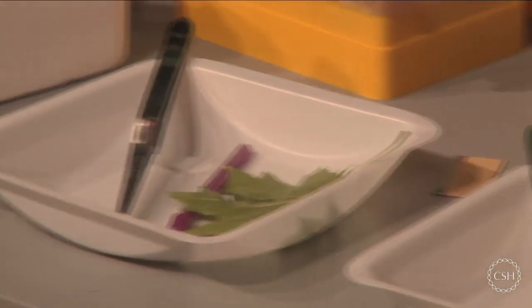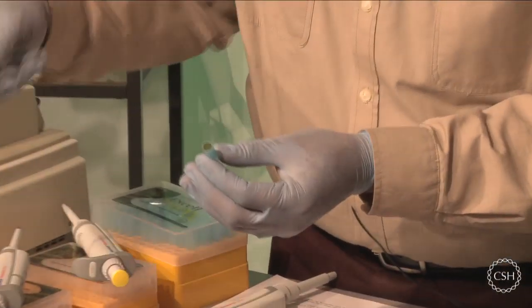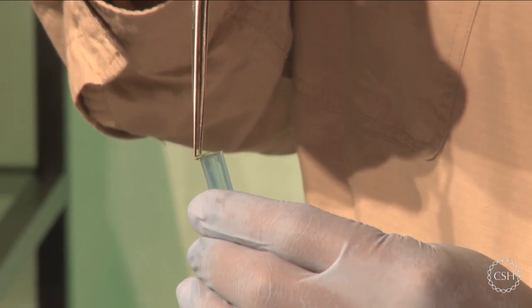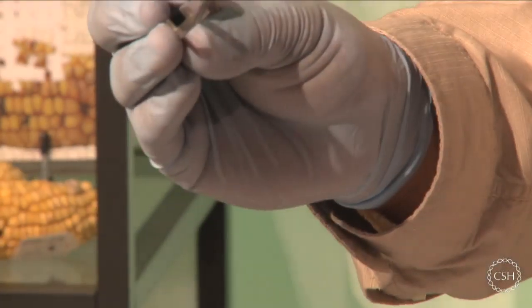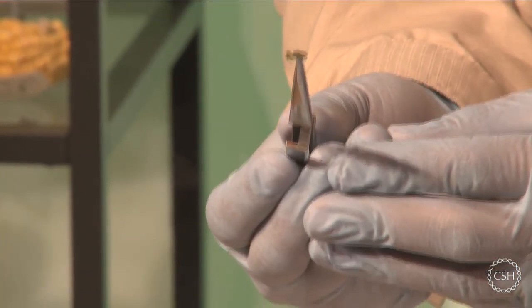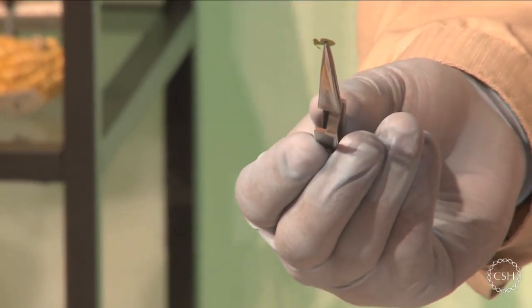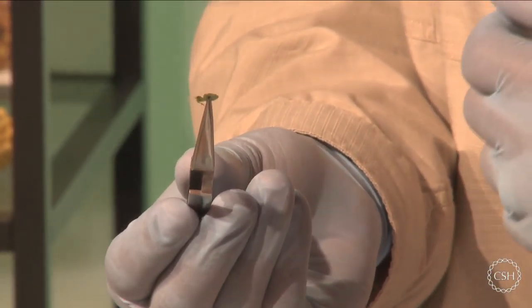Okay? So now I have a little bit of a punch of that tissue, and now I'm just going to go in there with my forceps and grab that tissue. There we go. So now I have my little piece of leaf, and that's all we physically need, is that little bit of a punch. We don't need any more than that. Any more than that is going to be problematic. We don't want to introduce more contaminants. So the smaller the piece, the better. But this is about the right size and will lead to us getting a really good product.